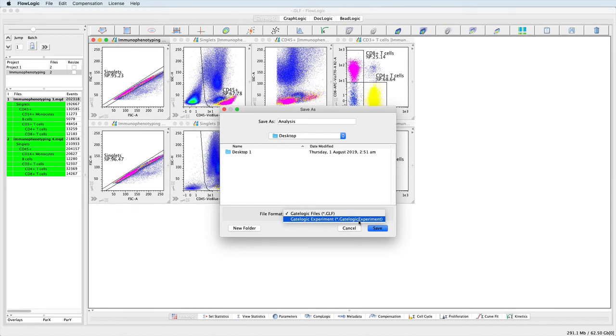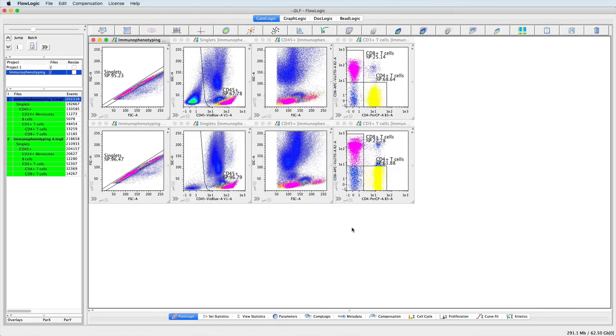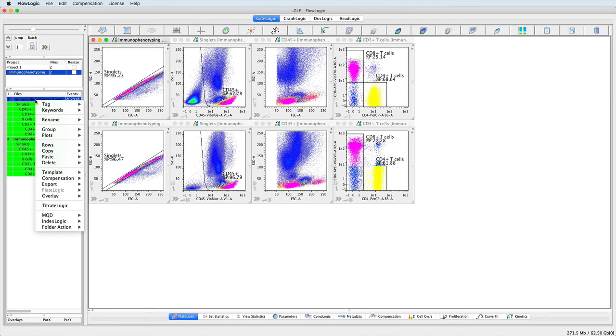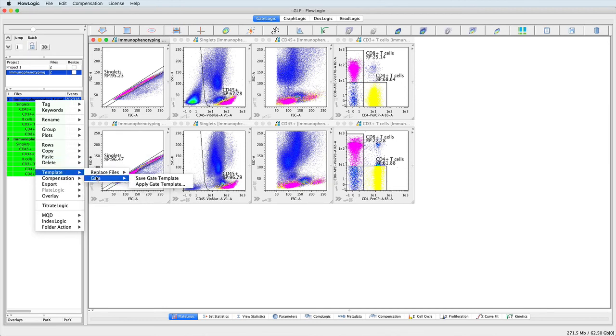In addition to saving the entire analysis, GateTemplates can also be saved. To save a GateTemplate, right-click on the file in the File Inspector, select Template, Gate, and Save GateTemplate.